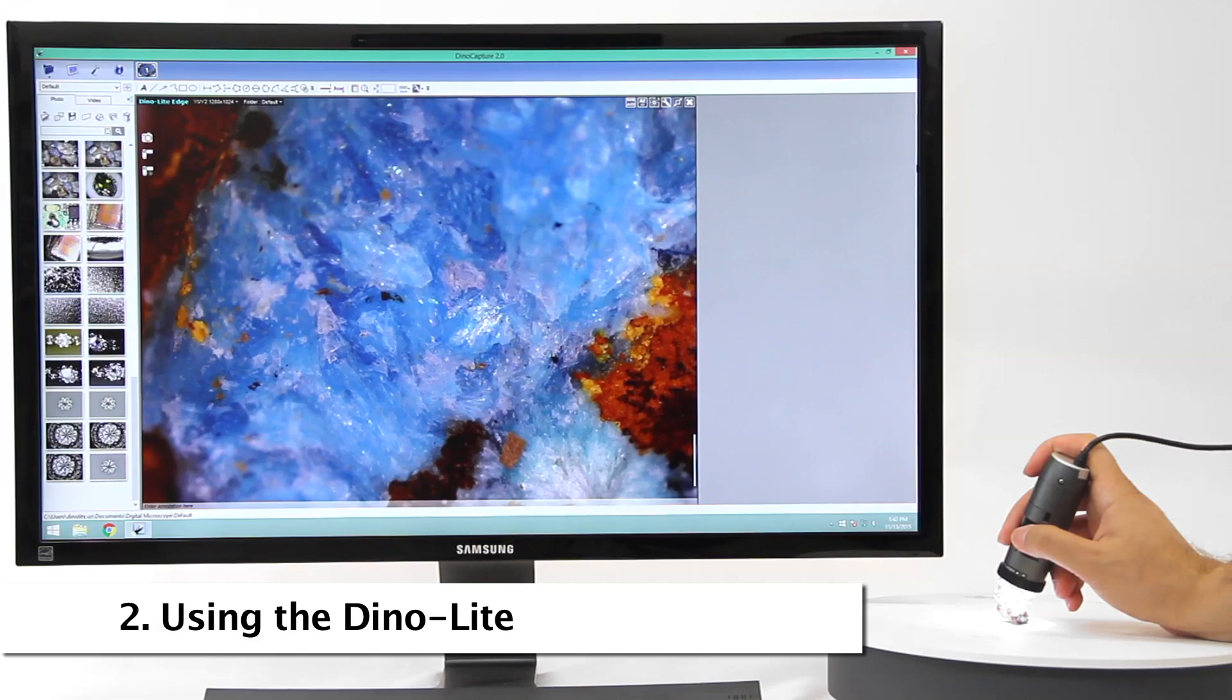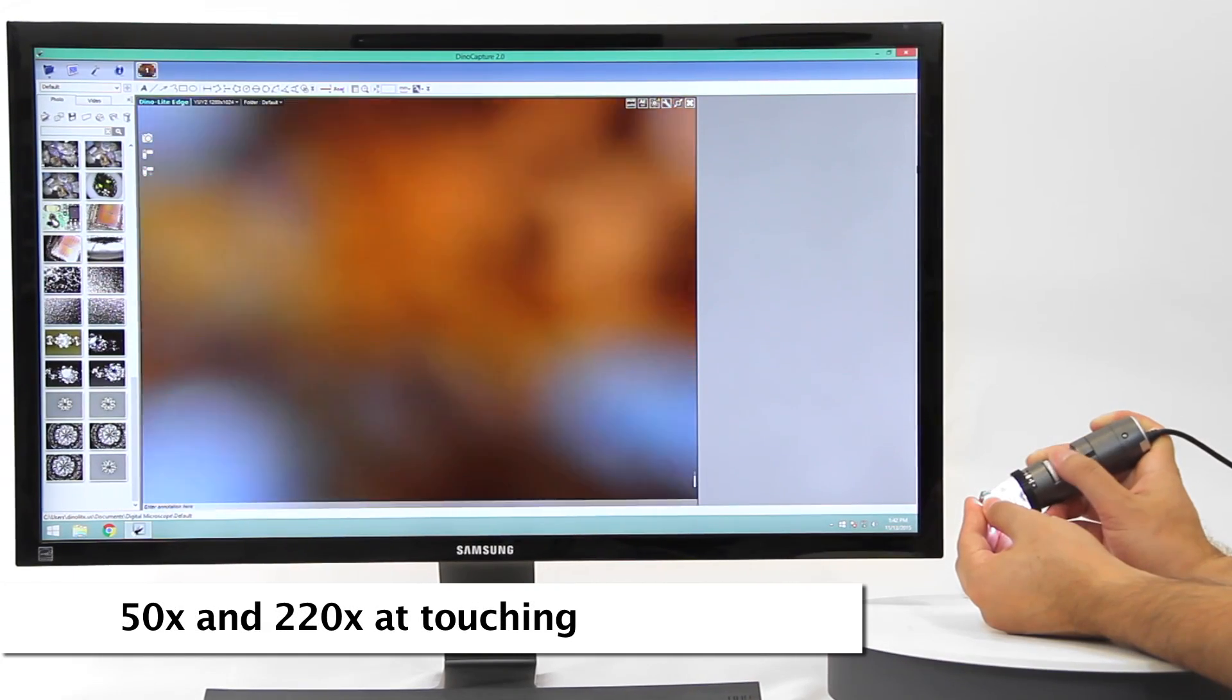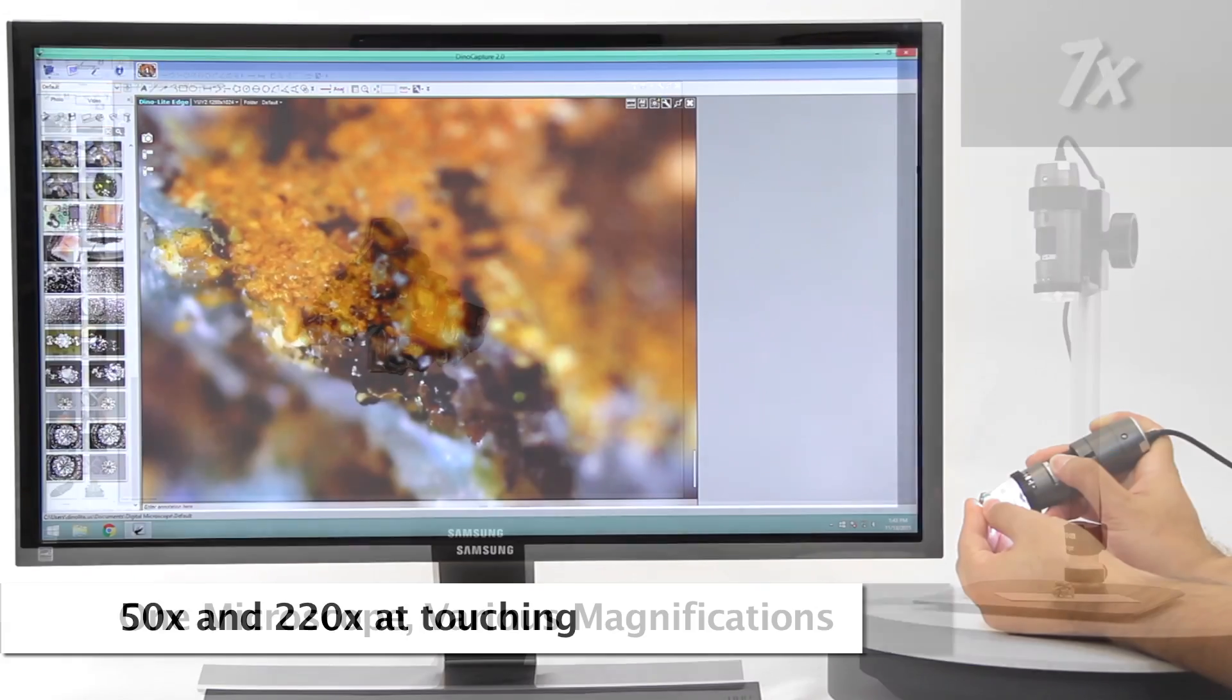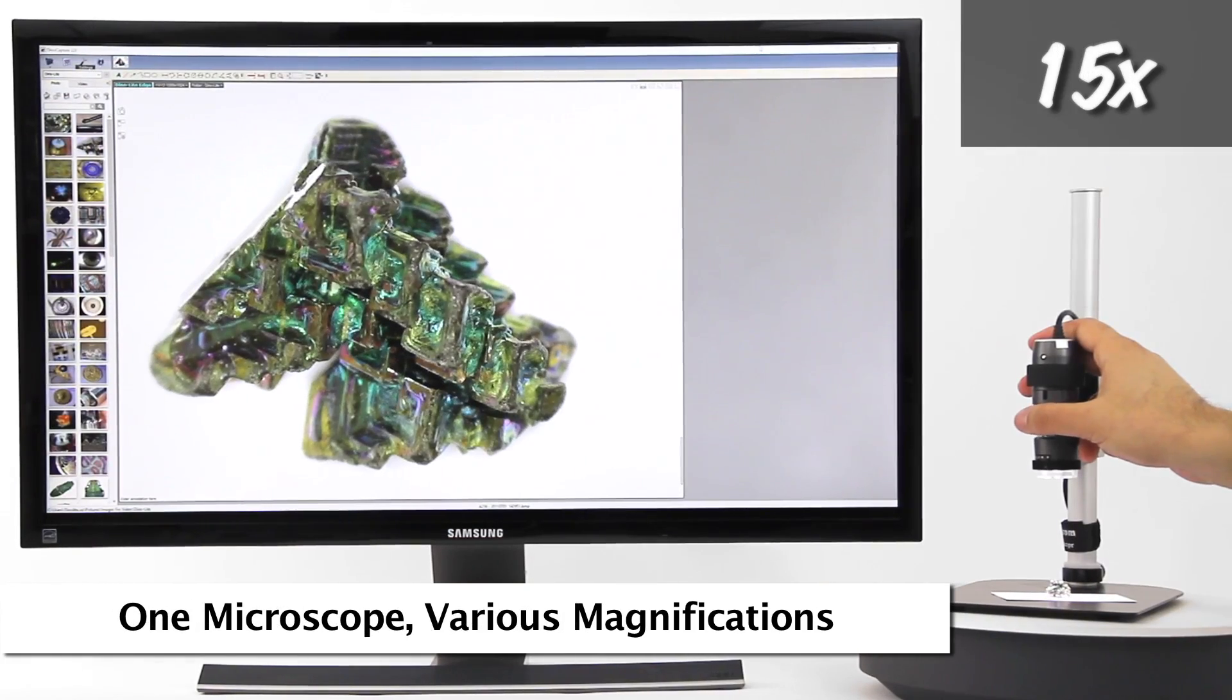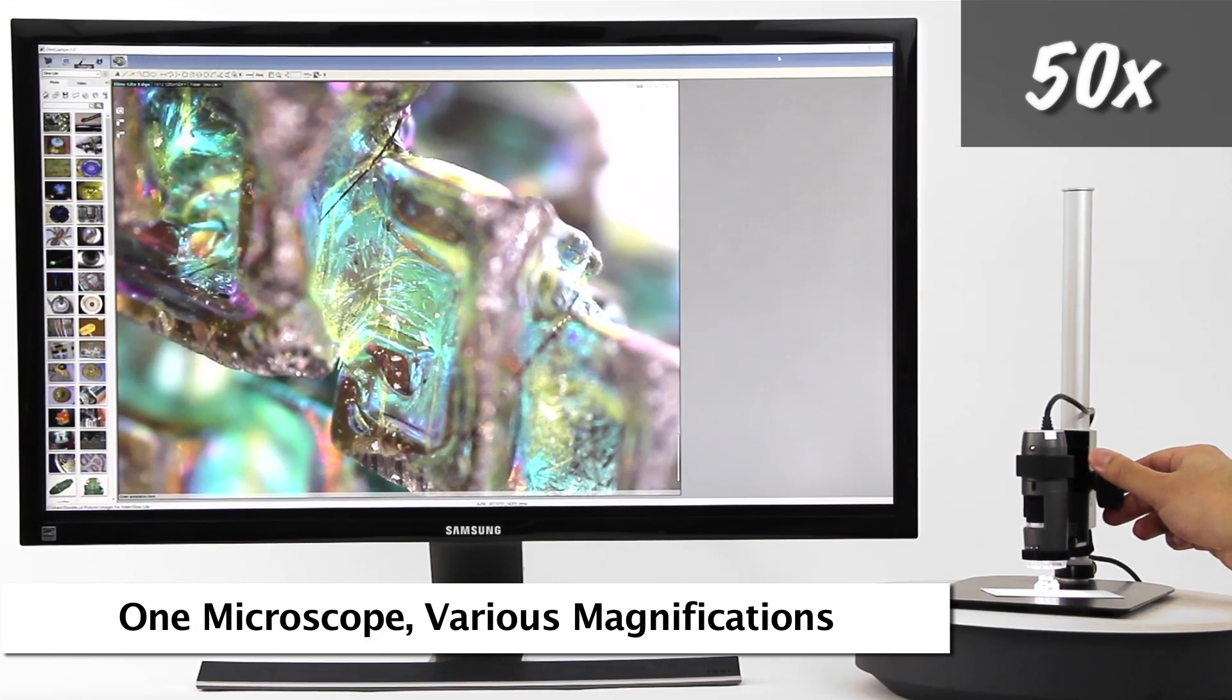Standard Dynolite working distance allows for 50 times and 220 times magnification when the end of the Dynolite nozzle is in contact with the object being viewed. This is an example of the standard working distance and corresponding magnification examples.